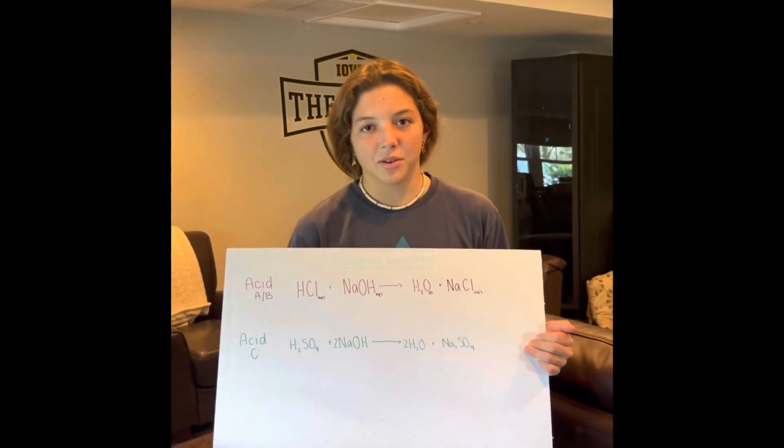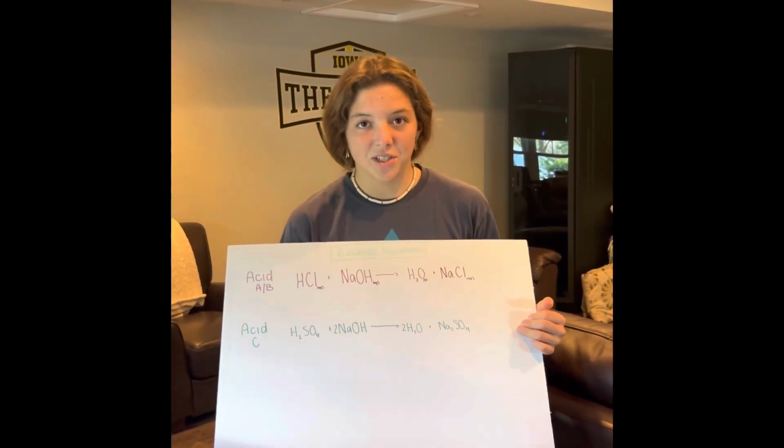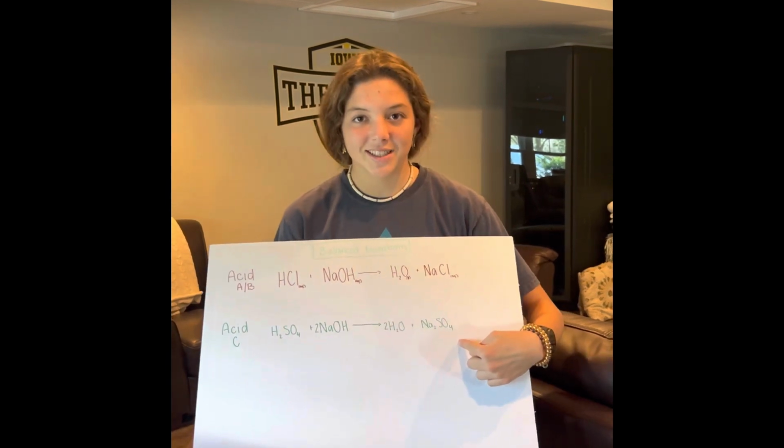The endpoint is the point in titration at which an indicator changes color. Indicators are a sort of pH meter. The equivalence point is the point at which the two solutions used in a titration are present in chemically equivalent amounts. These are the neutralization's balanced equations. The neutralization equation will result in a water and a salt.